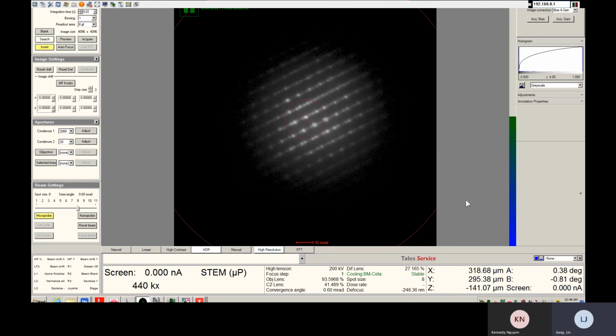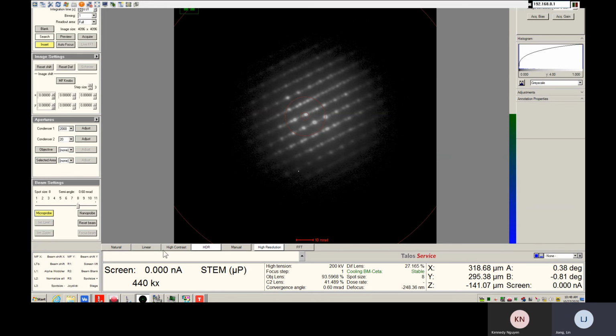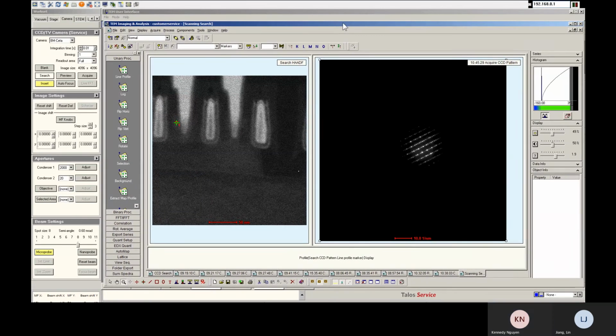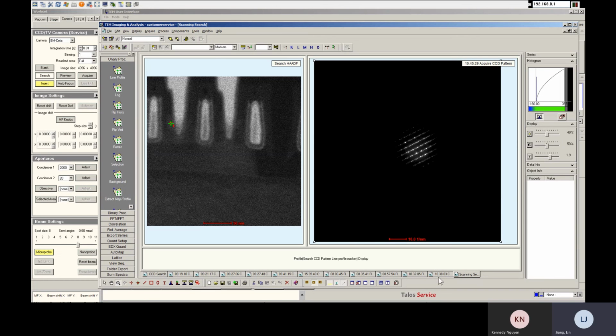Take a look at this. Do you have control? Because my mouse keeps moving down for some reason. Okay, good. Now I have control, but I didn't move my mouse at all. I'm not sure why. Oh, I have to move this mouse over there. Okay, now it seems fine.